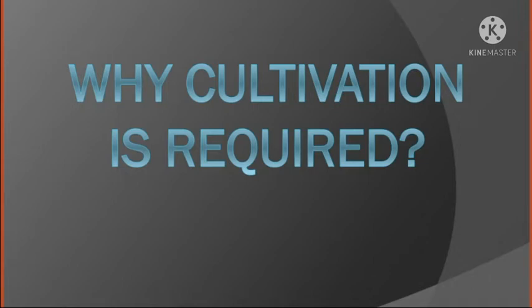Hello everyone. In this video we are going to talk about why cultivation is required, methods of inoculation, advantages of solid media, advantages of liquid media, and common staining techniques: gram stain and acid fast stain.